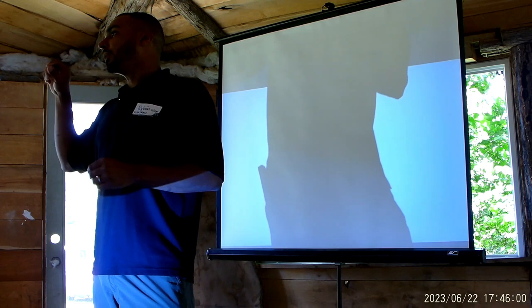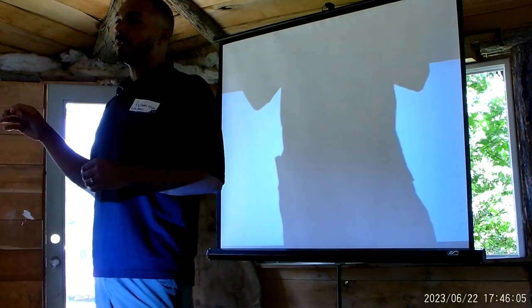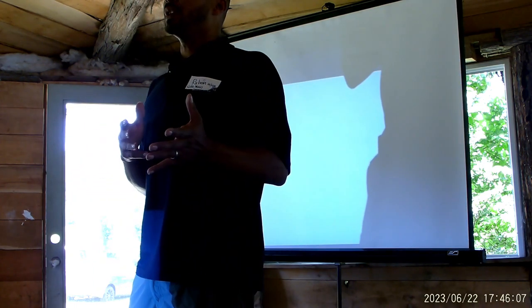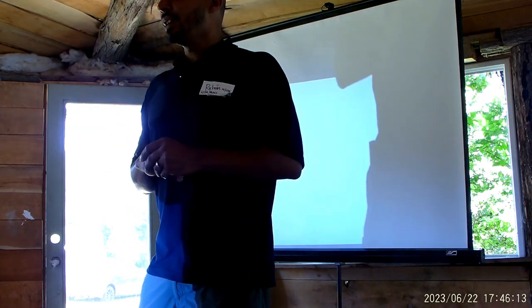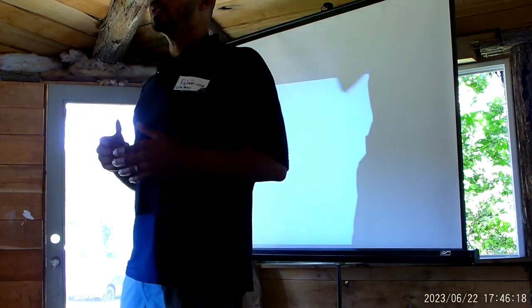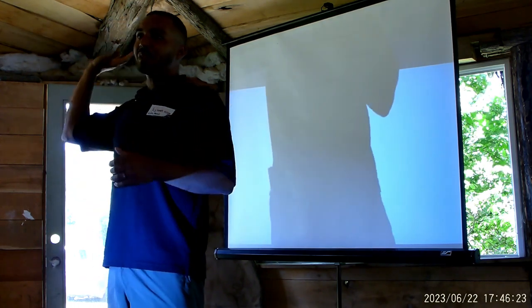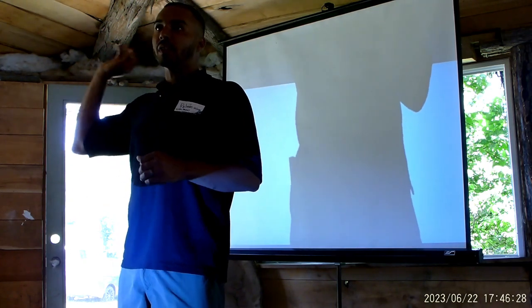The microbiometer is going to give us a count of total biomass. It'll also give us a bacteria and fungal ratio. It can't discern what types those are, but we are not going to be paying attention to those things because, quite frankly, it doesn't matter. What really matters is that we actually see different things in the soil. If you're going out to be a researcher and you want to write actual papers, then that's probably something you may want to get into, learning what these things are and what they're doing.